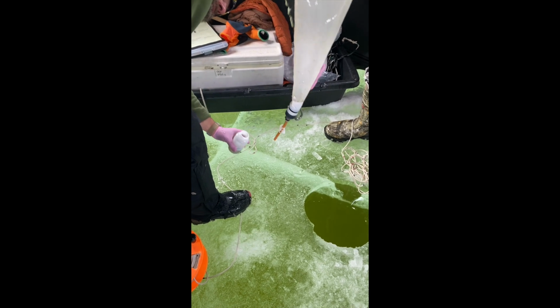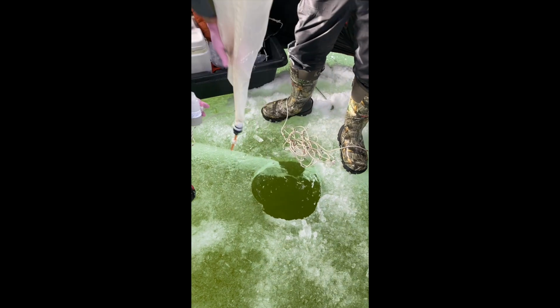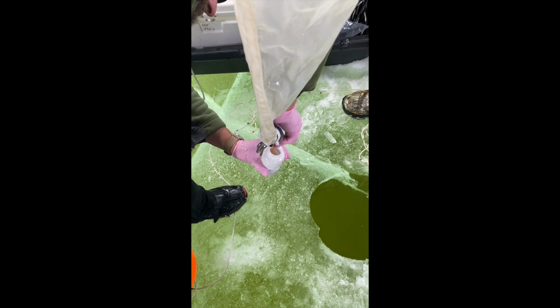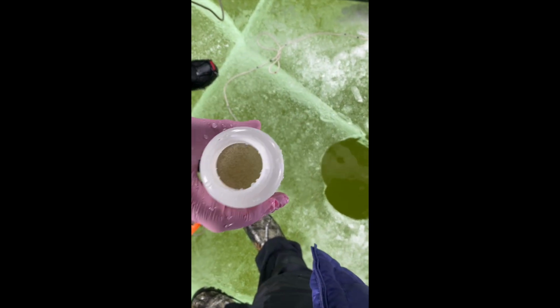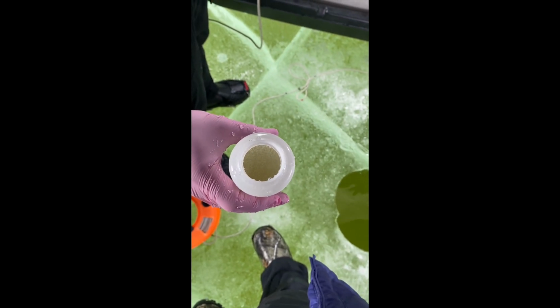Maybe with a third rinse. So much stuff here. Let's see the bottom here. So yeah, a single tow is definitely going to be enough. You can see that it's a very dense sample. I hope you can see that.